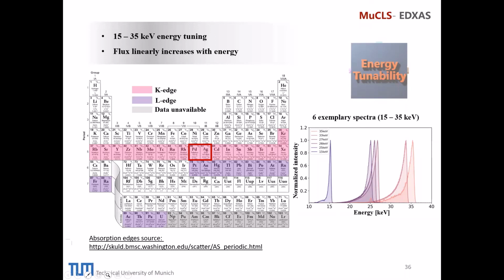So currently, how much of the time is this hutch used for XAS or energy dispersive XAS, and how much for other methods? Okay, currently we have several people doing different projects with the source. It's mainly me doing X-ray absorption spectroscopy, and apart from the collaboration with the chemistry group that I showed you before, we haven't got other real application systems so far.